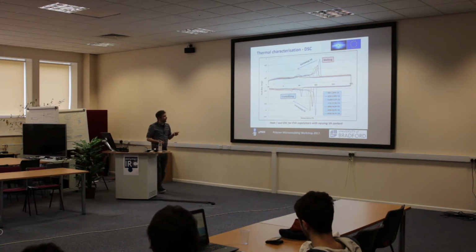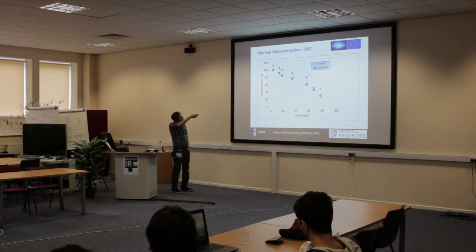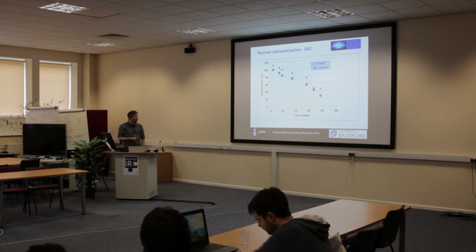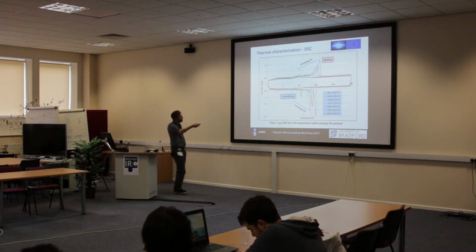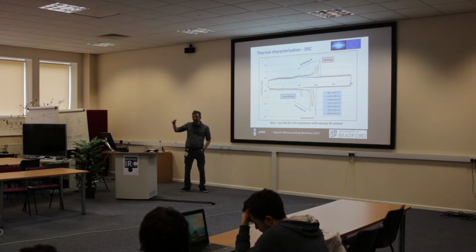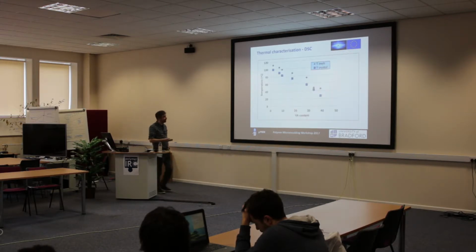And I keep showing that, but that's okay. So just taking those results out, you can see your melting temperatures and how they scan with the vinyl acetate content, and similarly your crystallization temperatures as well. Now I would have done the actual crystallinity, but the story gets quite complicated down here. Up here we've got single peaks, down here we've got kind of wavy peaks. There's all sorts of different crystals occurring down there, so I can't simply divide through to work out a true crystallinity value. So we have to go to other techniques.